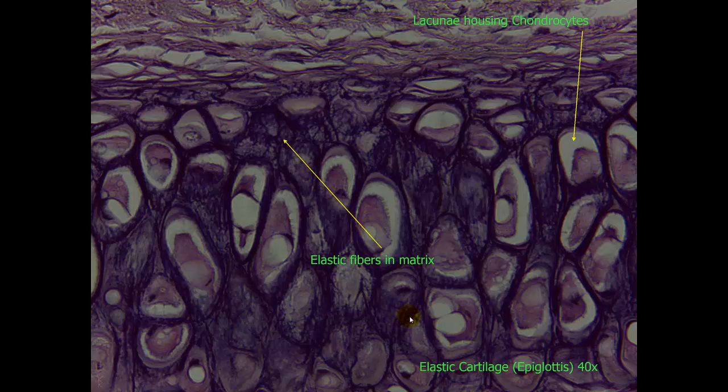Here is a 40x magnification of that same tissue. Here is your lacunae housing the chondrocytes. And here is the elastic fibers that you can see running in between the lacunae themselves. That is what makes it elastic cartilage.